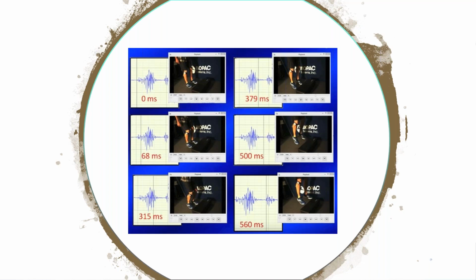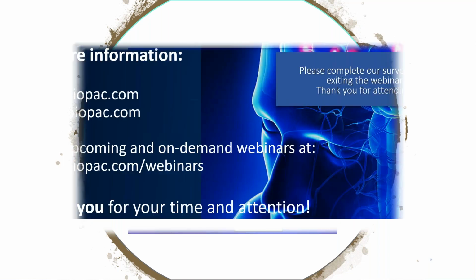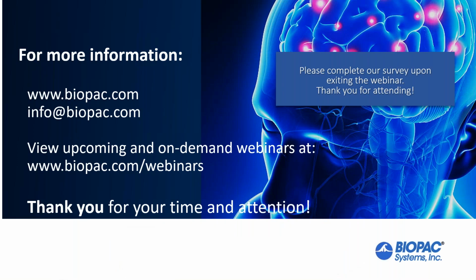We can also combine this with facial coding and eye tracking as well. So you kind of can synchronize everything. You get the video of the participant, you get the eye tracking information, any facial coding that you're doing. All of that is built in, plus the event markers coming in from ePrime, et cetera. So it kind of gives you a good overview of what we can do with video synchronization to physiological data. I'm going to hand you back over to Brenda for any final questions.